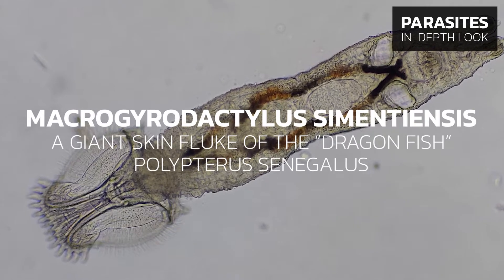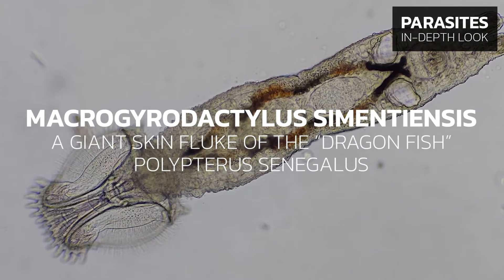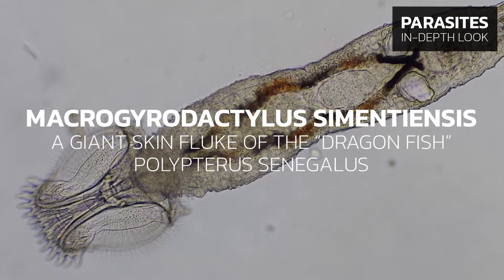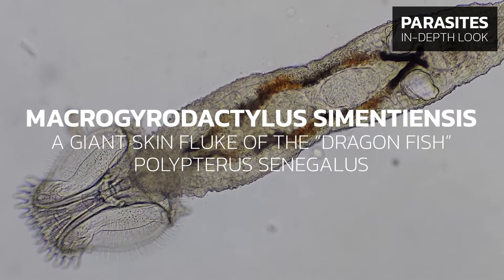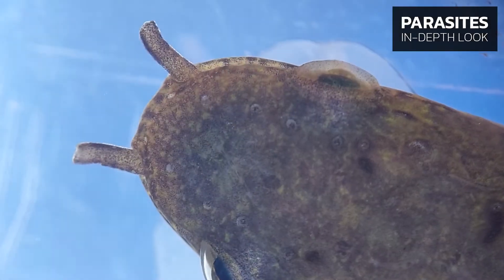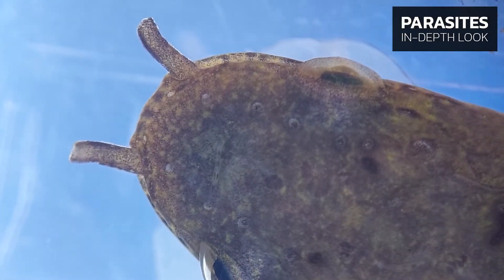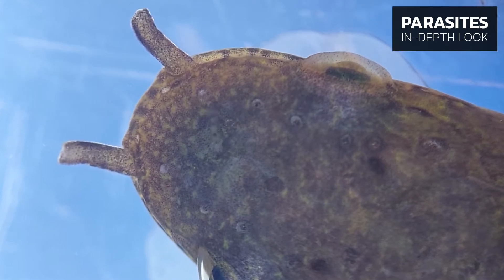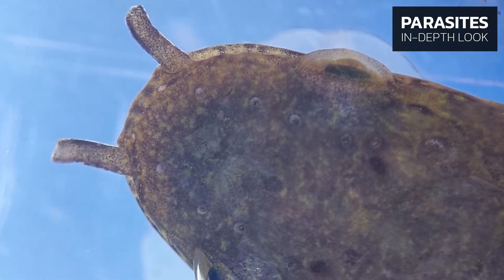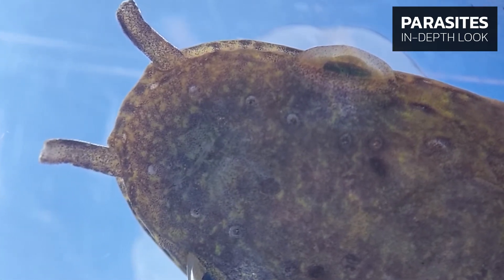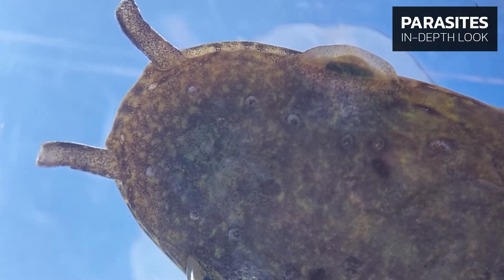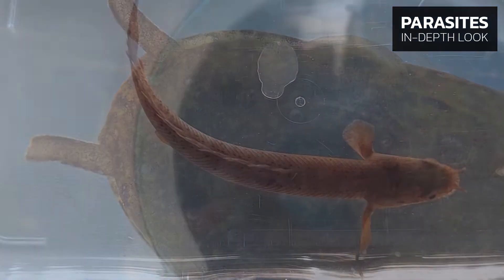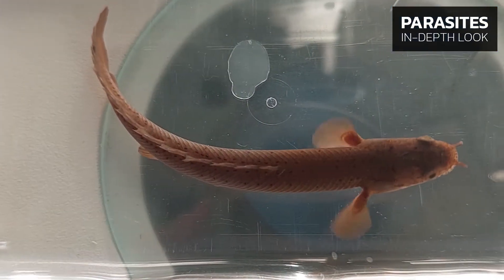Macrogyrodactylus simentiensis is a giant skin fluke of the dragonfish Polypterus senegalus. Members of the genus Macrogyrodactylus are among the largest parasitic skin flukes in the world, and are found on African fish species. Macrogyrodactylus parasitizes the prehistoric dragonfish Polypterus senegalus.